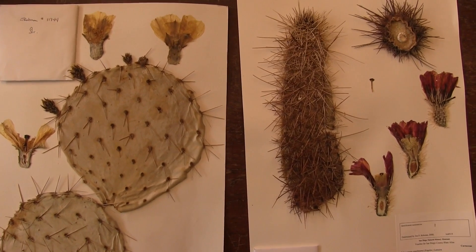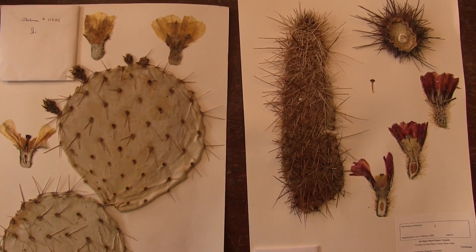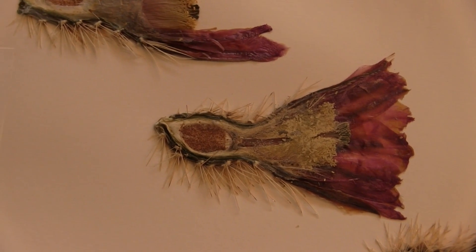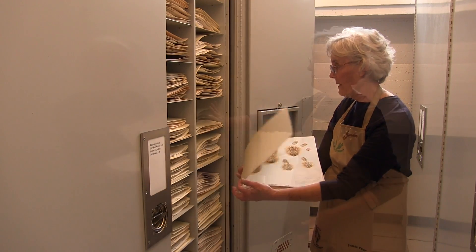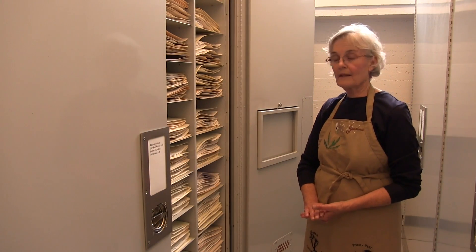After they're dry they're glued down and mounted with a specimen label as to where they came from, and they're then filed away so that other researchers can come in and see them.